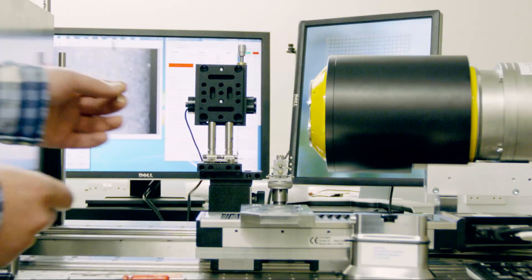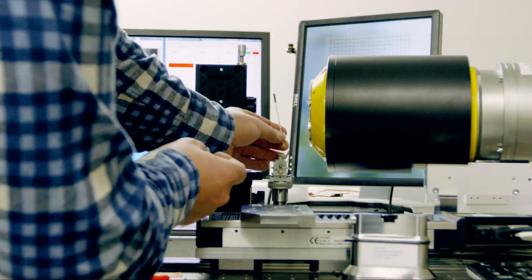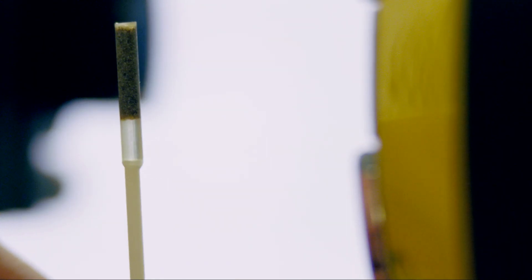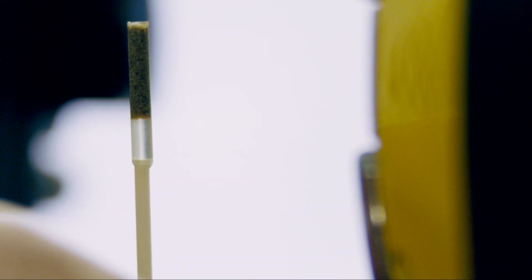The tomographic scanner that we have consists of an optical table. You have the X-ray tube that generates the X-rays. On the other side of the sample you have an X-ray detector.